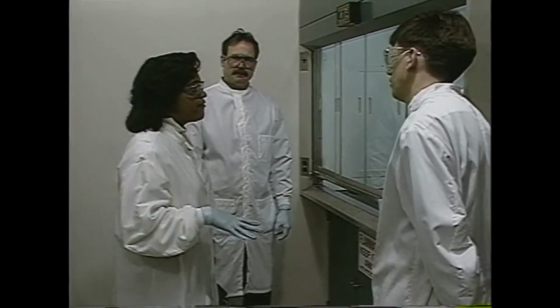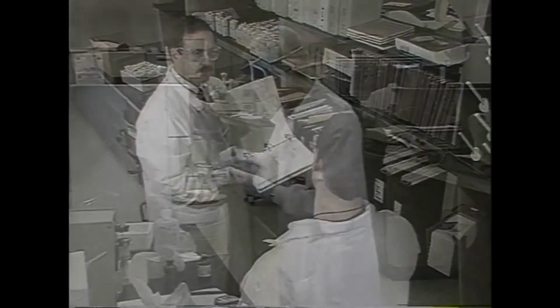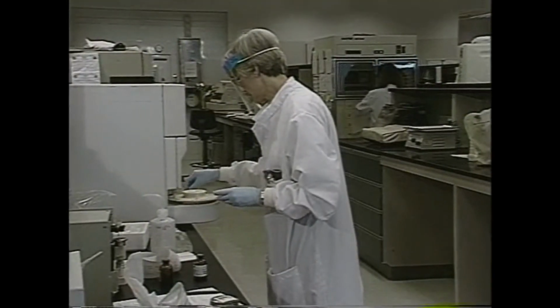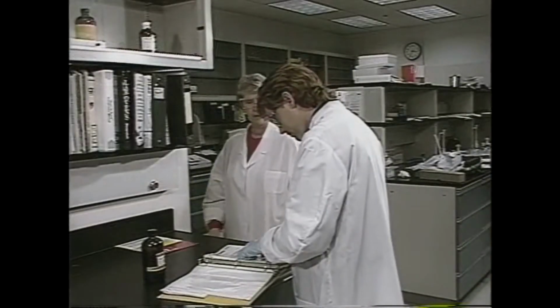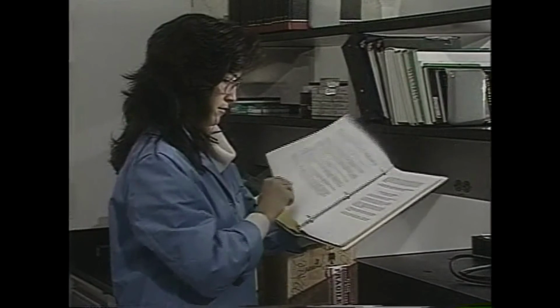There's no guesswork involved with working safely in the laboratory. OSHA's laboratory standard and your facility's chemical hygiene plan spell out the steps to follow to protect yourself from hazardous chemicals.